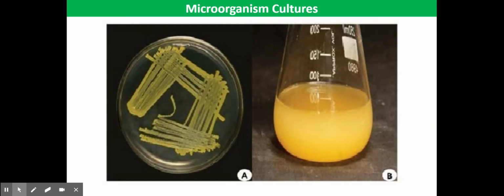This video tutorial is all about microorganism cultures. Specifically, it looks at how to culture microorganisms effectively using aseptic techniques.